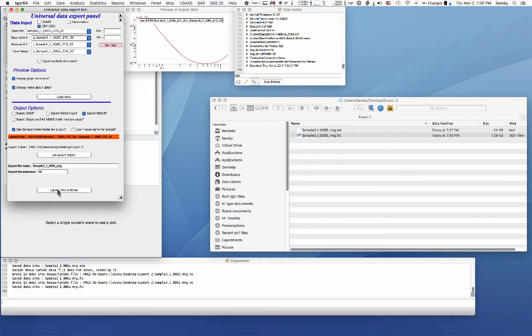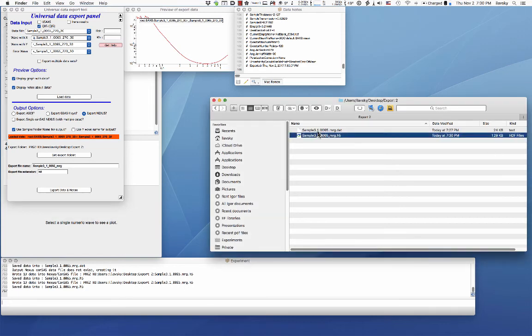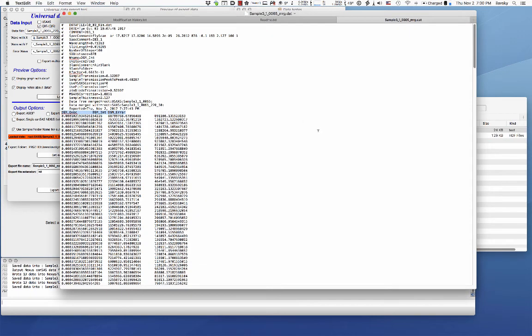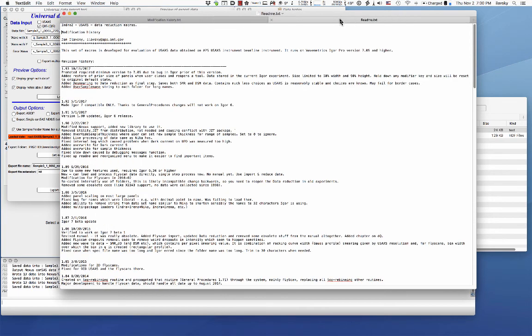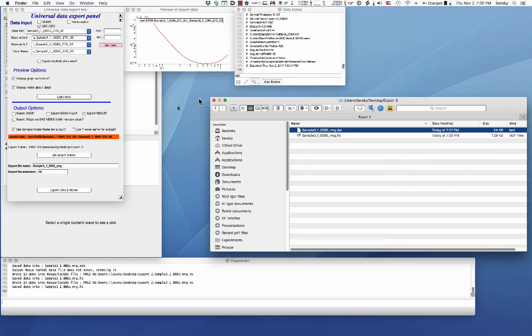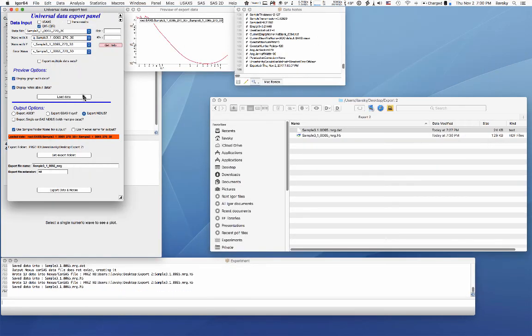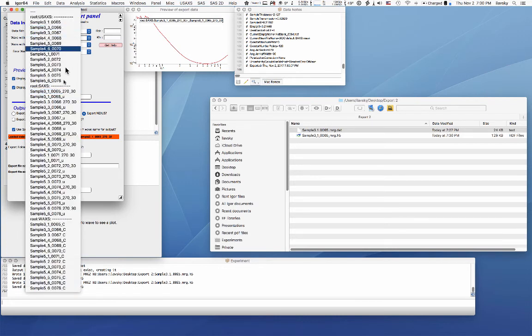And what happened? It just happened. Oh yeah, we just overrode them. And now that is, that is now exported. Anyway, so you can export those. The other thing which you can do is you can export for powder diffraction data, which would be down here.